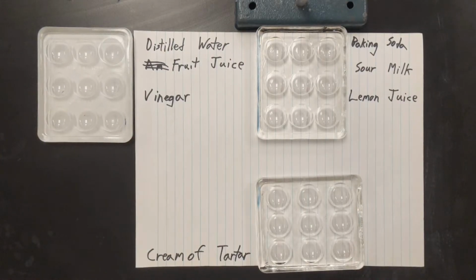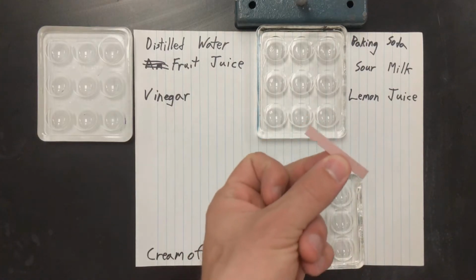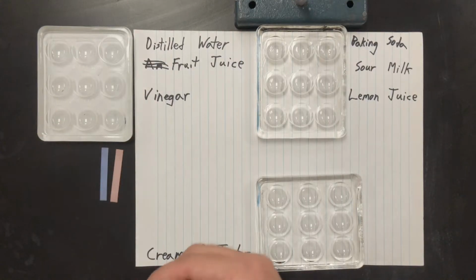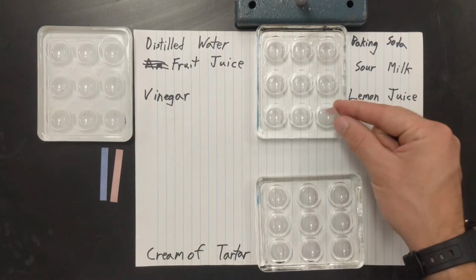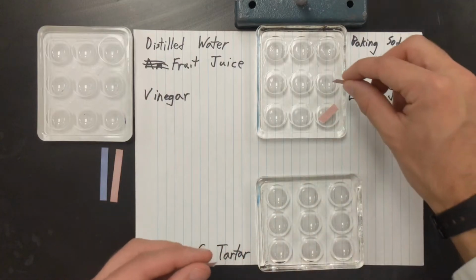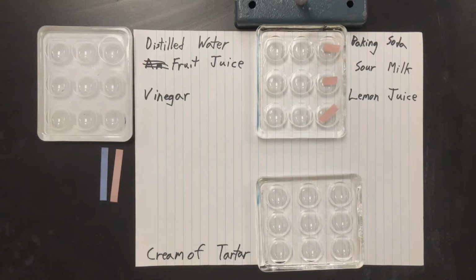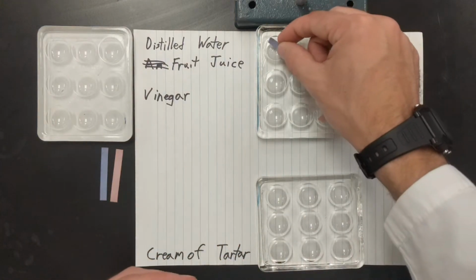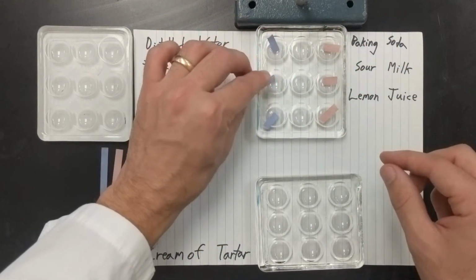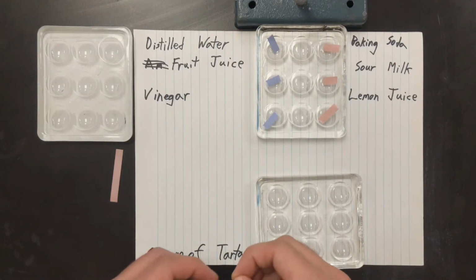All right, so what we're going to do first before we even start a lab is take our litmus paper. Here I have a red one and here I have a blue one, and we're going to rip it up into pieces. So here we have one piece down here for lemon juice, one piece here for sour milk, one piece here for baking soda. We're going to do the same thing with the blue litmus paper. Rip it up into 3 pieces, one for each. There you go. So one for each, and we're going to rip up the other one as well.